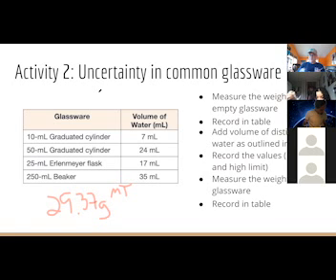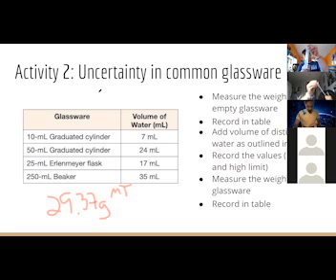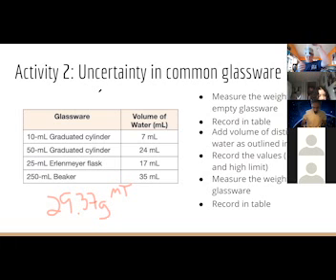So I'm just going to tap this till everything comes down. Okay, I've got some bubbles in here, so I want to get rid of those. You can also just tap it. Good way to do it is get a pencil or a pen and just tap the side. That's a good way to get rid of bubbles. Or it used to be anyway.